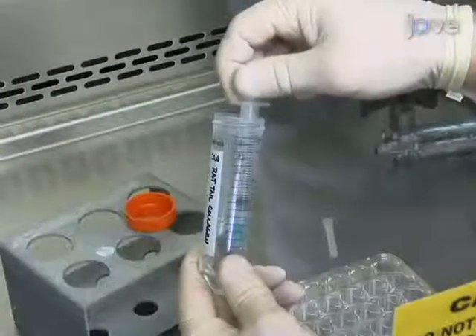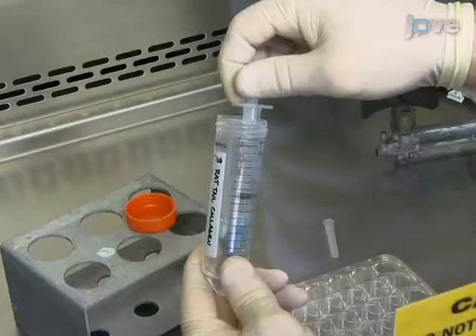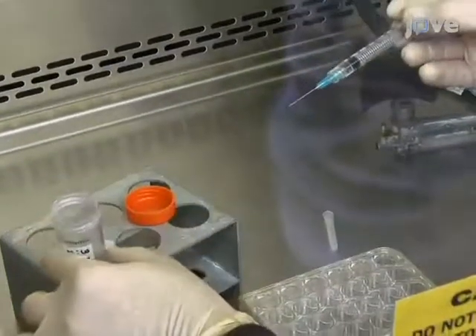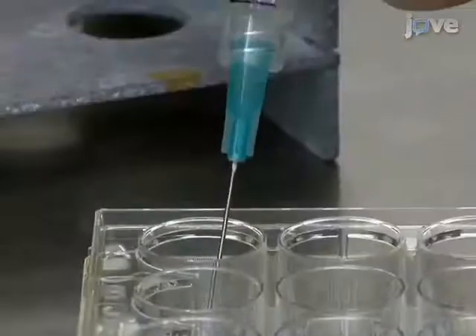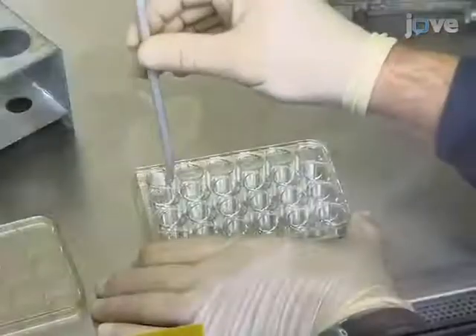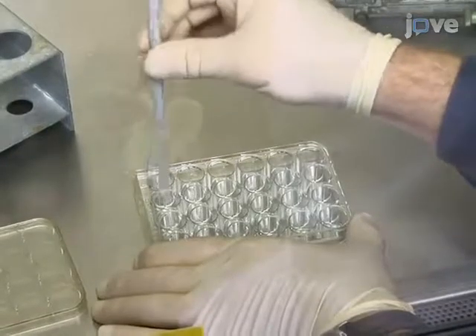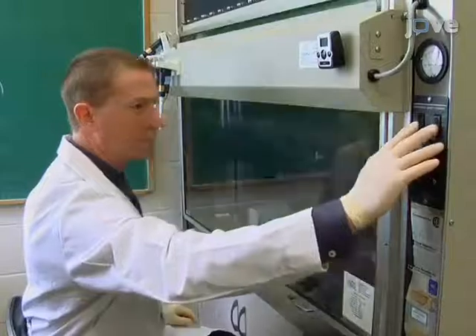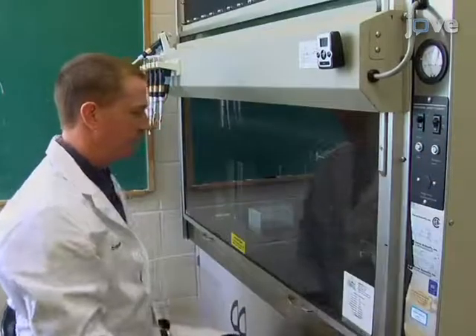The day prior to neuron isolation, for immunofluorescence applications, coat glass coverslips in a 24-well plate with a light coating of 3-to-1 Rattail Collagen-1 Poly-D-Lysine solution. Spread the solution evenly over the coverslip. Rest the coated plates uncovered in a tissue culture hood under UV light overnight.